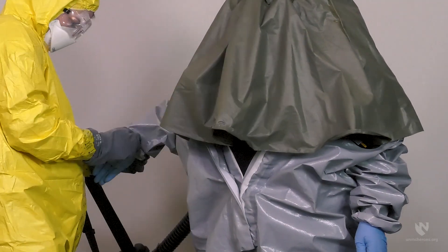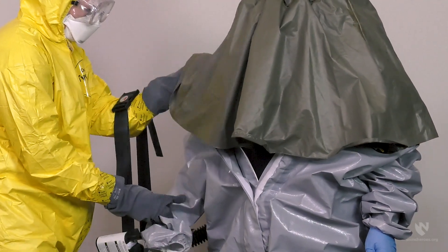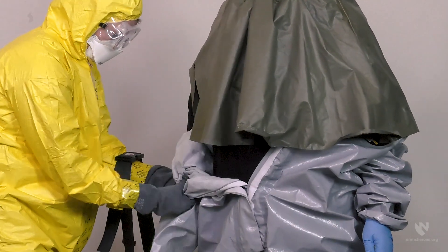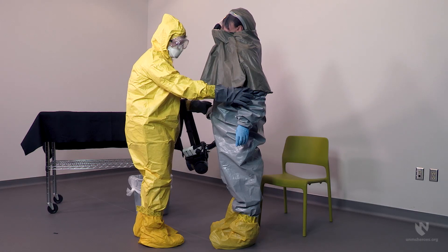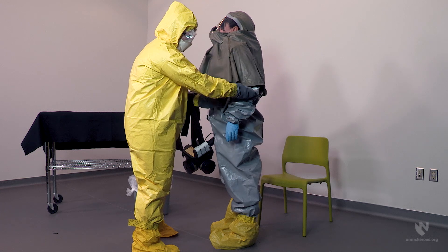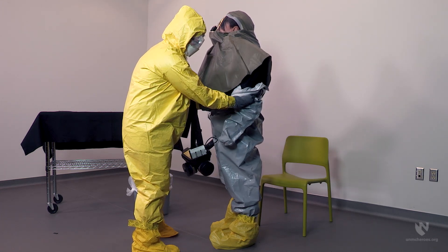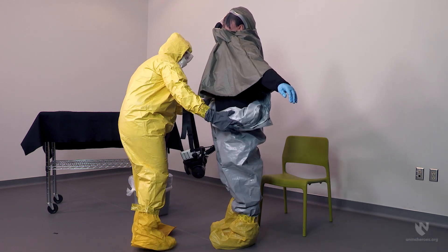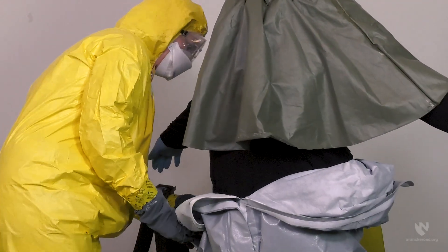Guide the suit down over the arms and the wrists. Once the Decon member's top half is free of the suit, continue rolling down to knee level to prevent the suit arms from becoming uncontrolled.